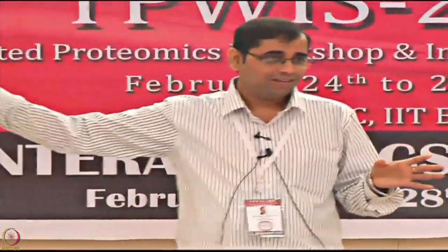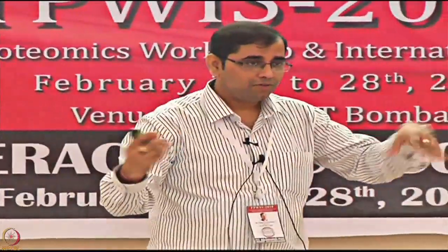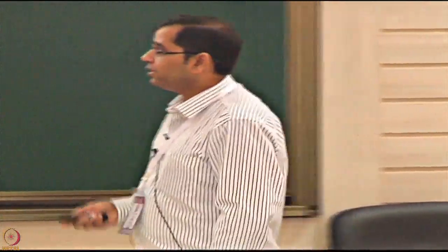Sometimes a good experiment may involve every technology we are studying in the different workshops right now, starting from discovery with mass spec based and microarray based approaches, taking those leads forward and then validating using these kinds of label-free platforms. So everything has its own utility, and you have to pick the technologies in the right context.